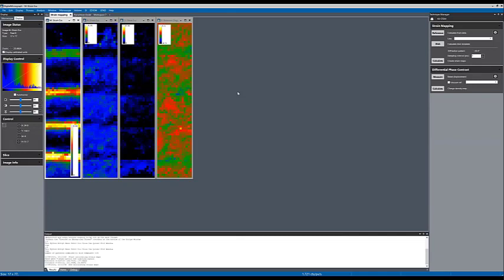Exactly. Just to add to that, during the demo I had a GSO as a substrate, right? So if I want to calculate the strain on the top layer, the thin layer, I would use that as my reference. That's just one of the examples. If you do not have one, you could even use a simulated data set with exactly the same conditions that you want to compare. Or if you don't have any reference, you could always refer to the mean.